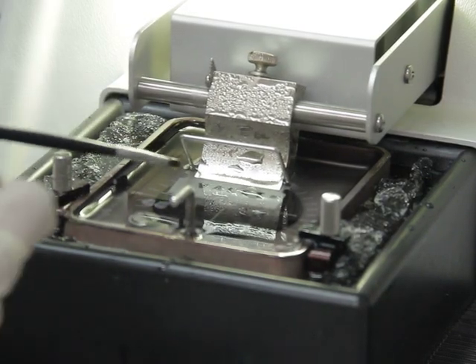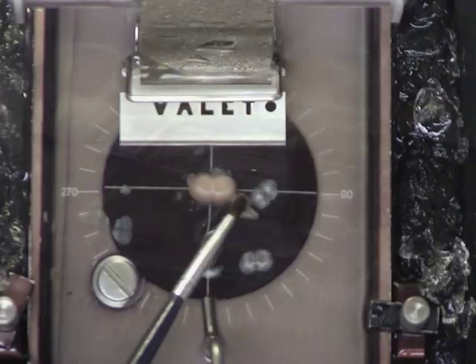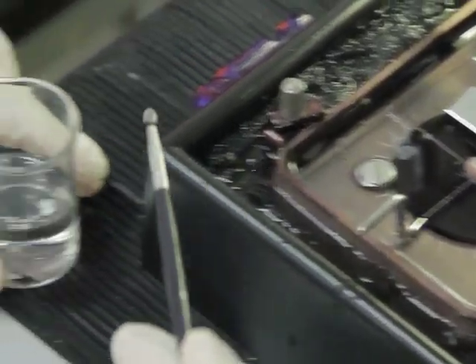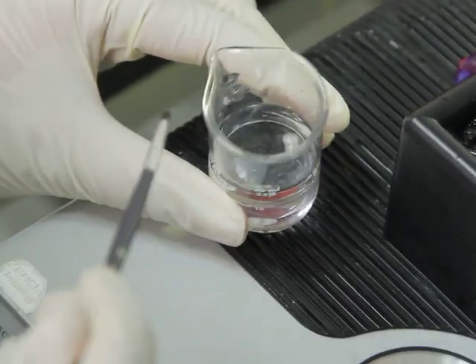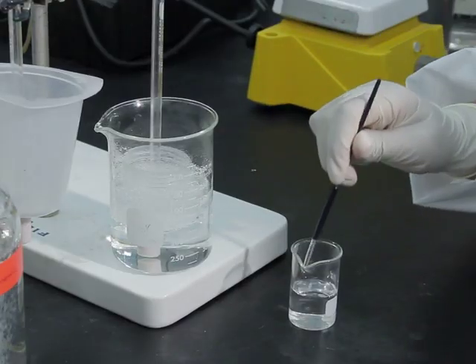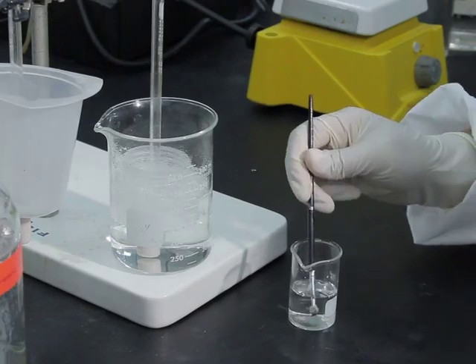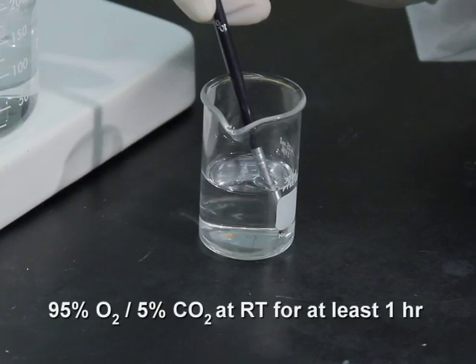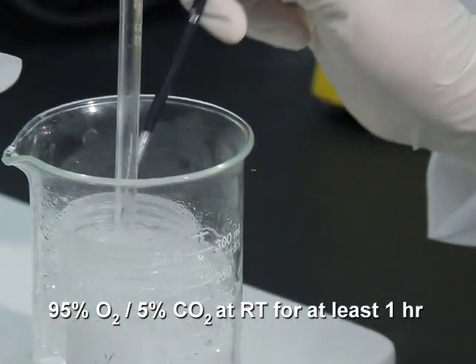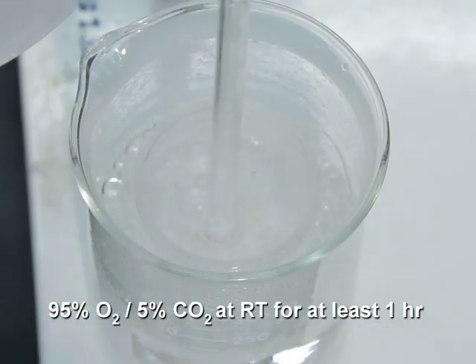Once the striatal region is reached, use a paintbrush to lift the slice and place it in a beaker with oxygenated room-temperature ACSF. Typically, one can obtain three to four slices containing the striatal complex, in which the caudate putamen and the nucleus accumbens are included. Allow the slices to acclimate in ACSF bubbling with 95% O2 and 5% CO2 at room temperature for at least one hour before proceeding with the experiment.